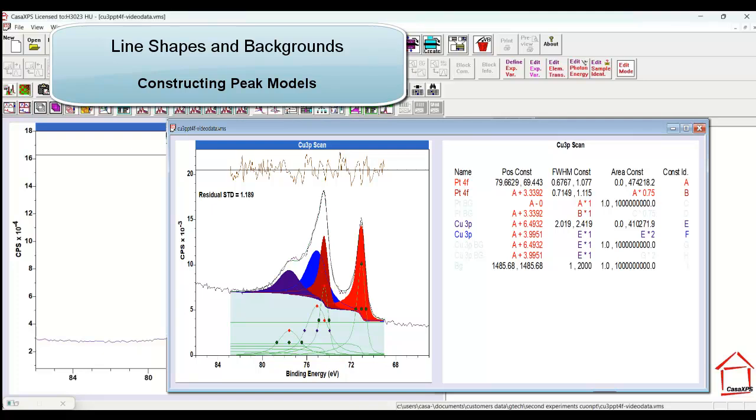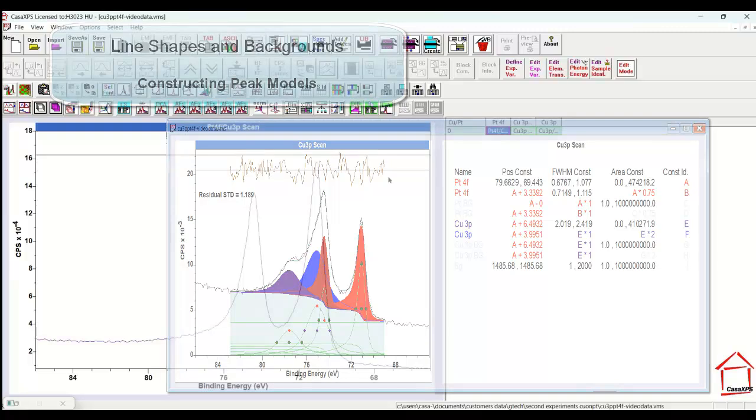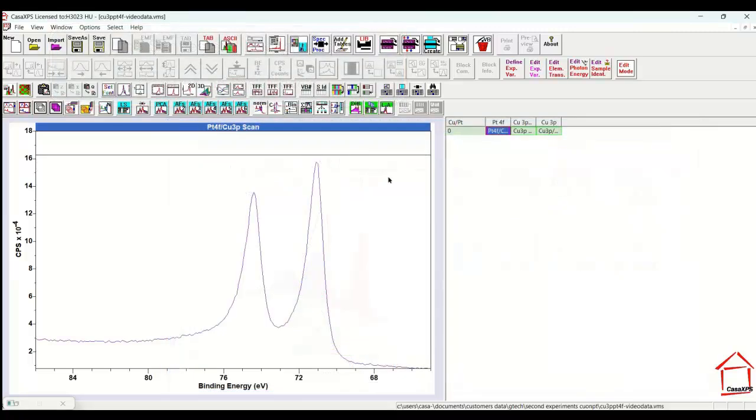In this video, I'm going to look at a material that contains both copper and platinum. In order to construct a peak model, because platinum 4F and copper 3P overlap, a peak model is required if you want to separate signal from a material that contains both platinum and copper.